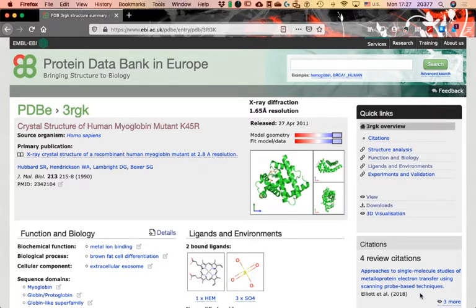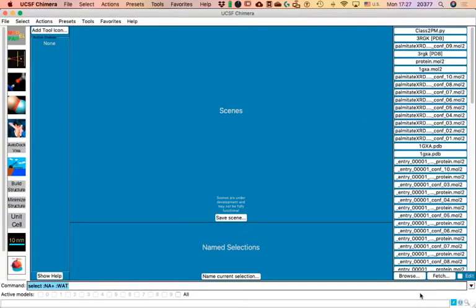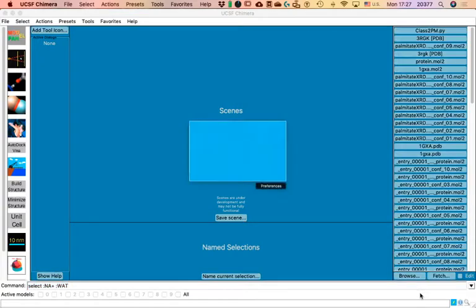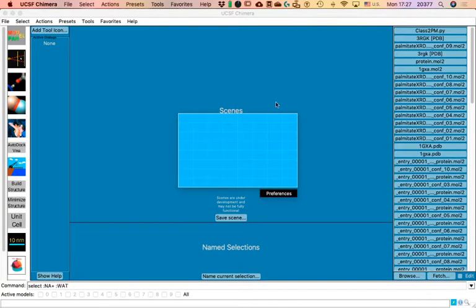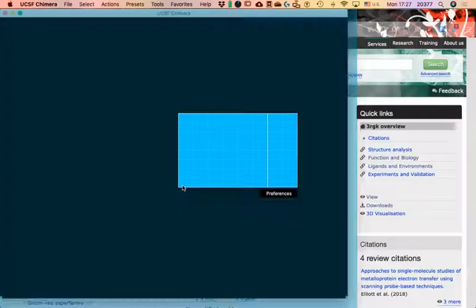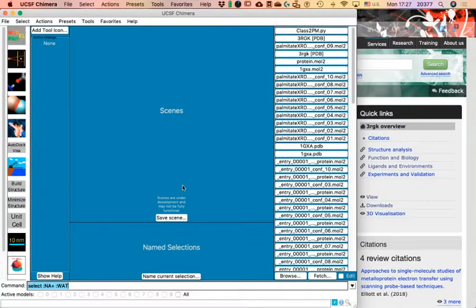There are plenty of things to explore here, some quite cool and others not so much. But I prefer to teach you how to use Chimera, because Chimera can integrate a lot of these things together so that you don't have to be browsing through tons of tabs in your browser.